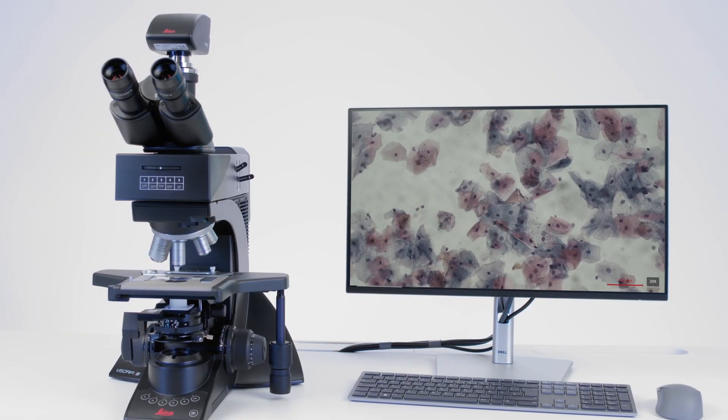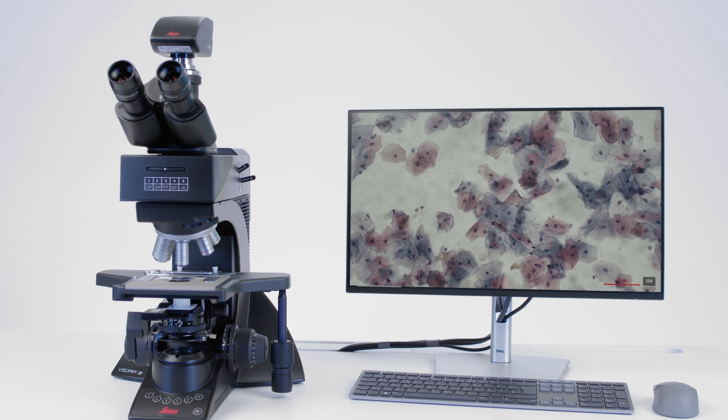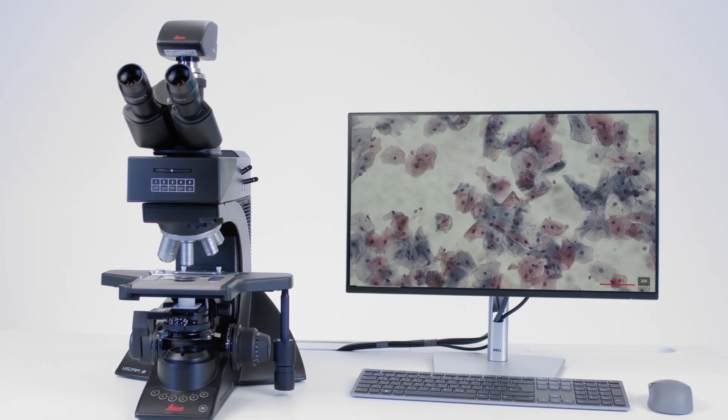Power up your routines with efficiency and comfort using the Visoria B Laboratory Microscope.